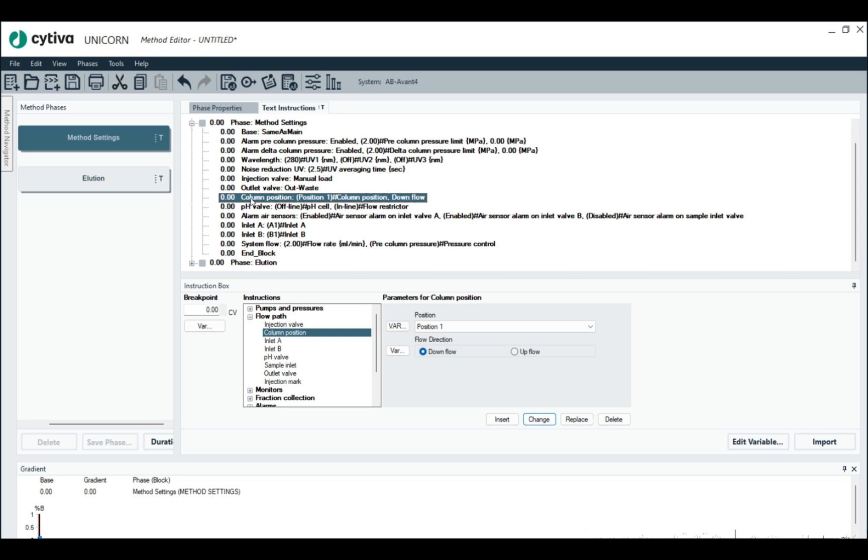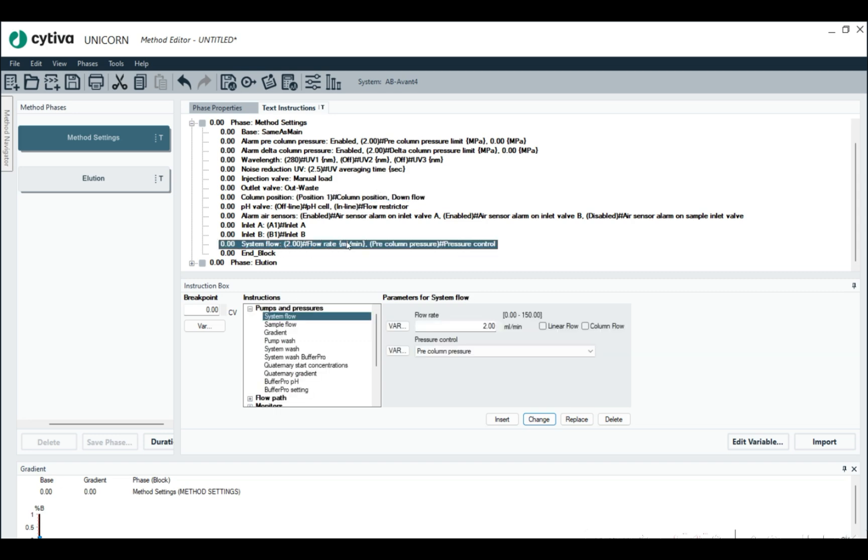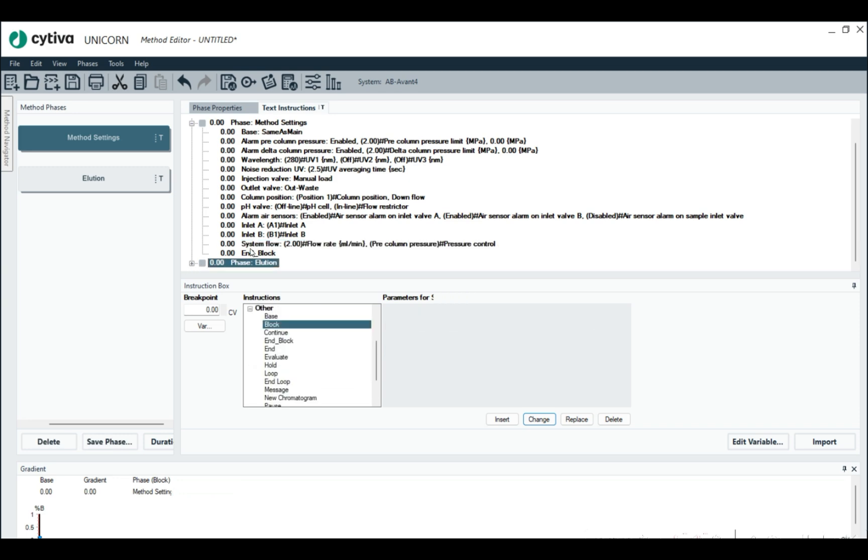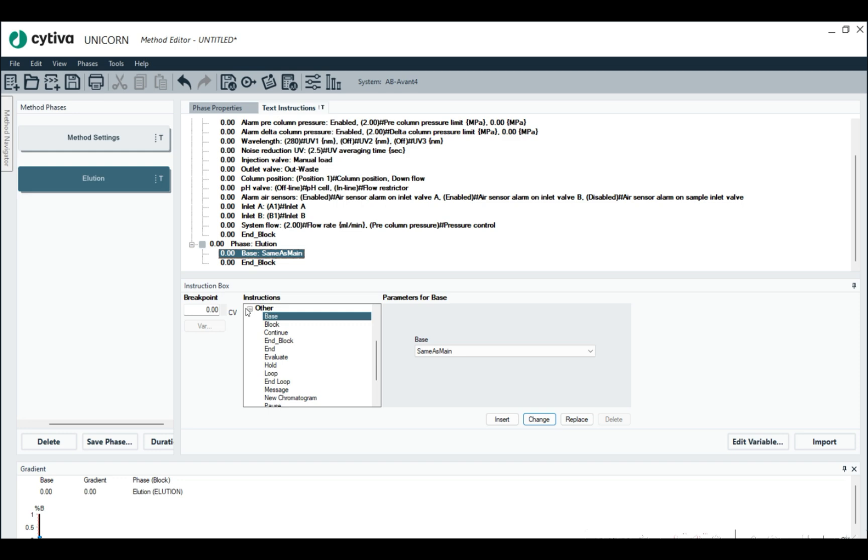Just imagine again, we're doing an SEC run is what we're writing. So we have a column in position one, the system flow is going to be at two mils a minute. And for the elution phase, obviously somewhere in between here, we would have some sort of sample application phase.